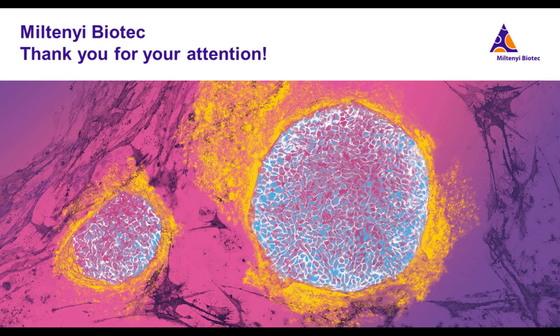Thank you. Now, can we quantify TILs? Sorry, can you repeat that? Sure. Your question says, can we quantify TILs? Yes, you can quantify tumor-infiltrating leukocytes because you can, first of all, easily identify them because you can stain a lot of markers. So therefore, you can really be sure that these are tumor-infiltrating leukocytes. And the resolution is, of course, standard immunofluorescence resolution. And therefore, yes, you can.